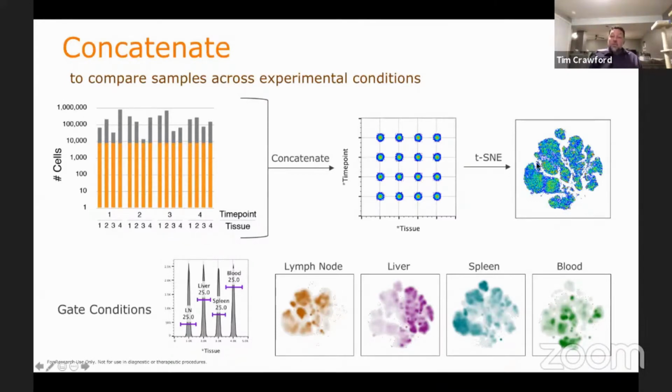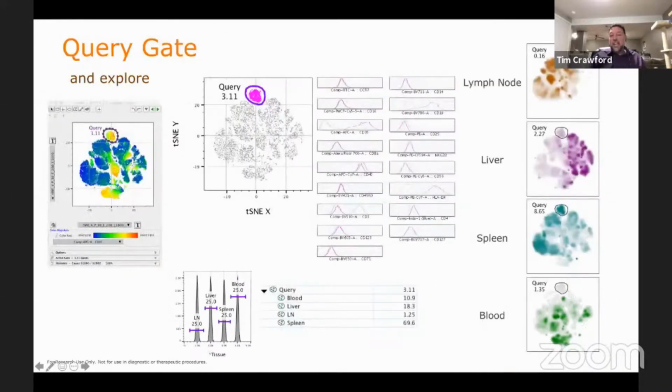But you can do a lot with this visualization once you have it. Even without subsetting into clusters, you can create a gate. And this is why I like T-SNE, because it's a very flat, separated visualization, and so the different regions will be distinct populations. UMAP has a tendency to cluster or layer populations on top of each other that are within a lineage, even though they group together. So with T-SNE, I like to make a gate, make an overlay.